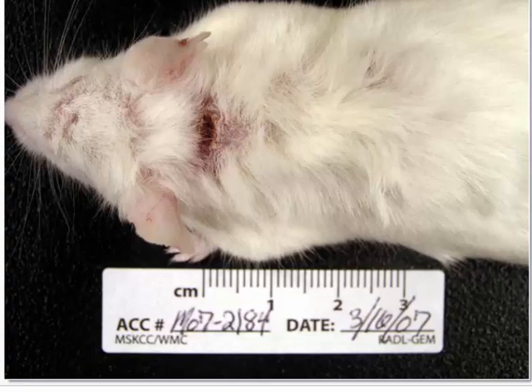Mice also do get mange. The most common mange mite that is seen in mice is Psorergates simplex, the follicular mite. Under the microscope, the hair follicles will be greatly distended and have numerous mites within them, almost looking a little bit like comedones.